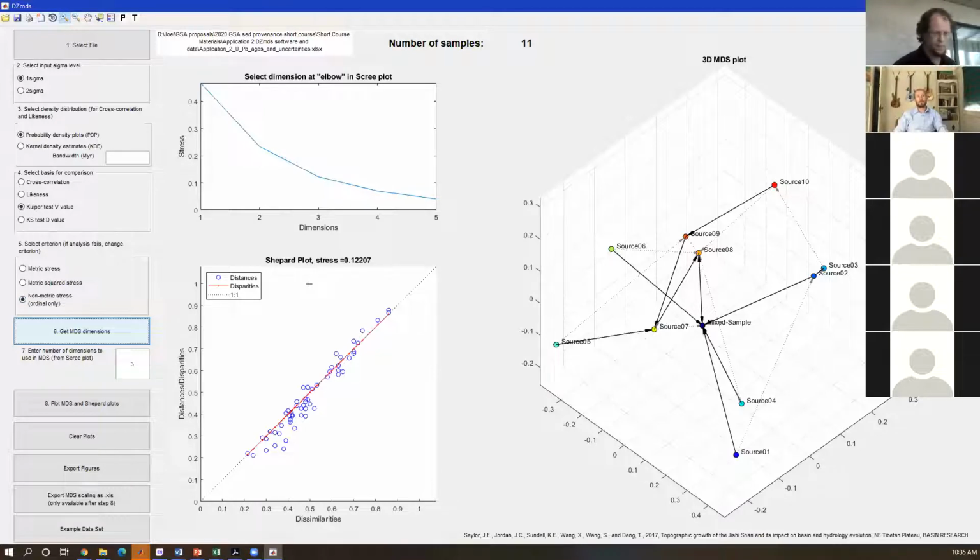And probably what that means is that you've got data points that are sitting right on top of each other, that it's unable to sort of pull apart. And so you're going to wind up with an error. And so there are a couple of options. If you get that ding of death, my recommendation would be, simply try a different stress metric. And that's why we've got 3 here.